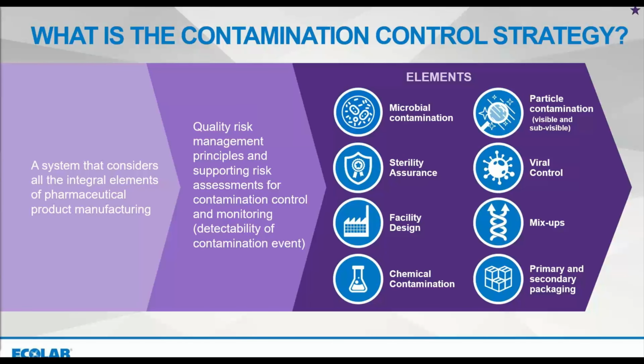In terms of some of the core elements, we've obviously mentioned microbial contamination and particulate contamination. But we've also got the wider philosophy of sterility assurance, which extends from the raw materials through to the design of clean rooms.